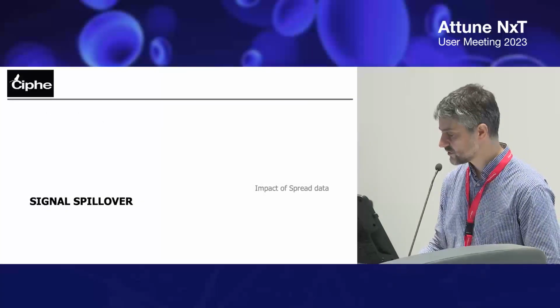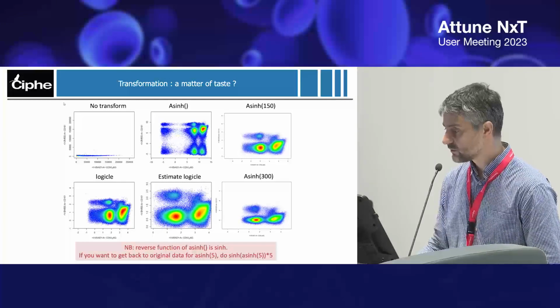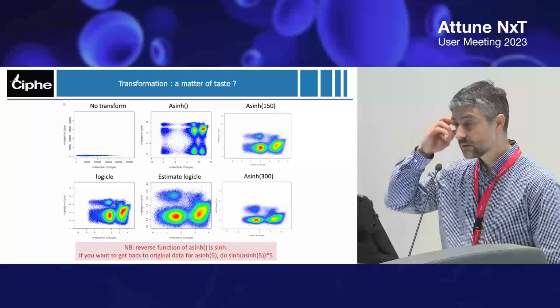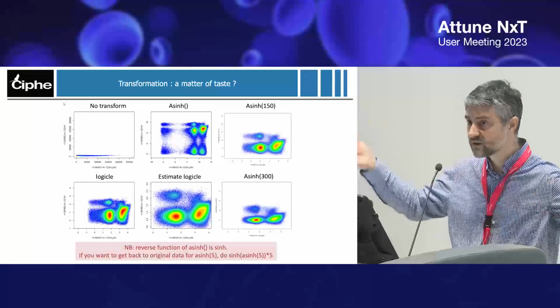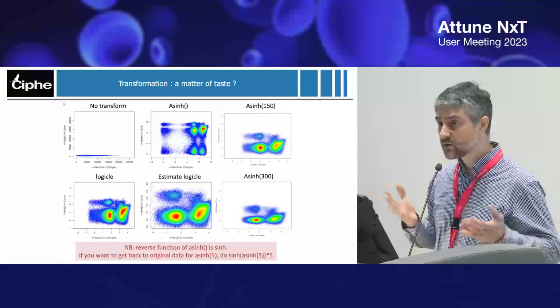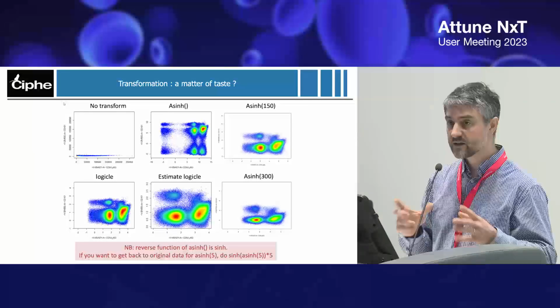Now just a short take on this. It's nothing to do with images, but when you start playing with single cell data, one of the very important points is how you scale the data. In these image parameters, we get some intensities on the Attune in the range of 10 to the 7, and then you have others, like area, that are really small.